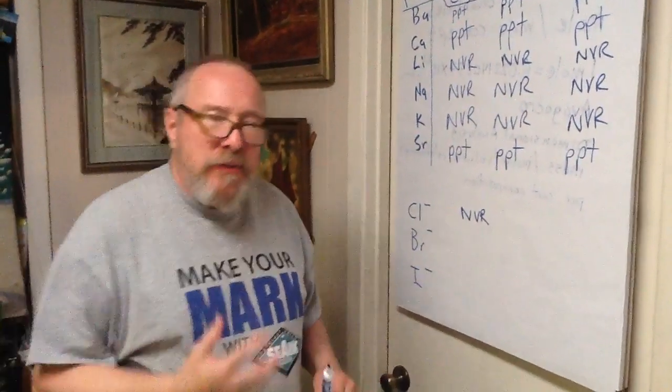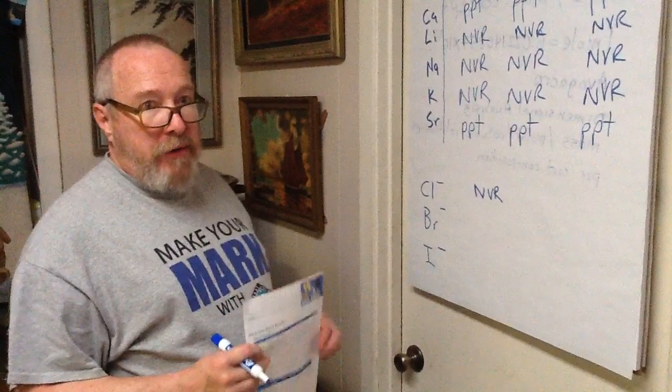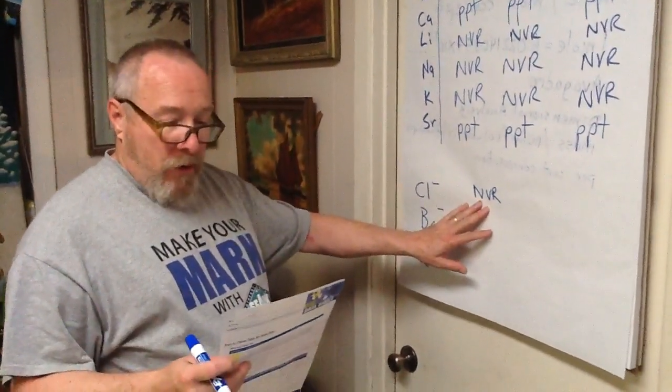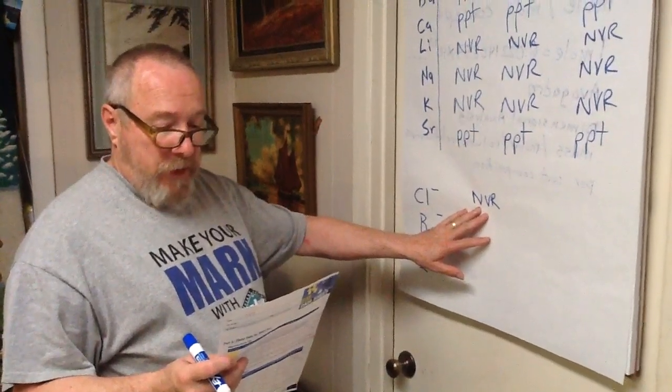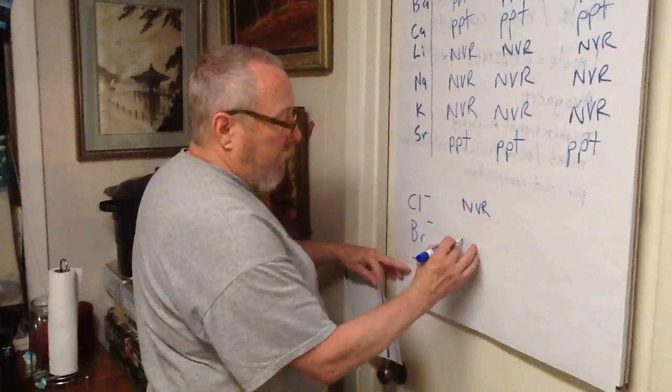That halogen test produces a colored product that we extract into a hexane layer. And when we reacted the chlorine, we got no visible reaction. Okay? With the bromine, we got an orange-yellow color.